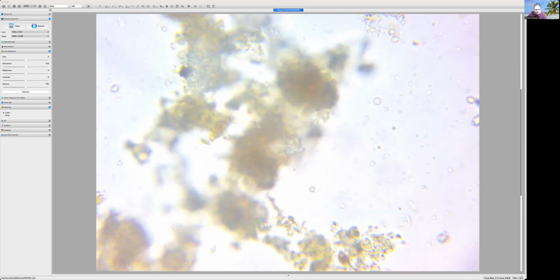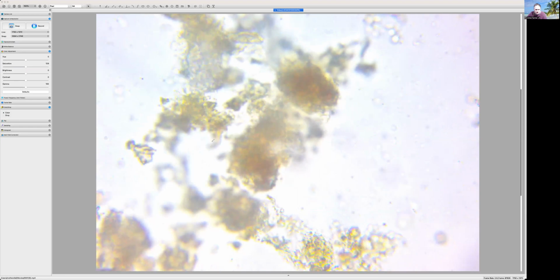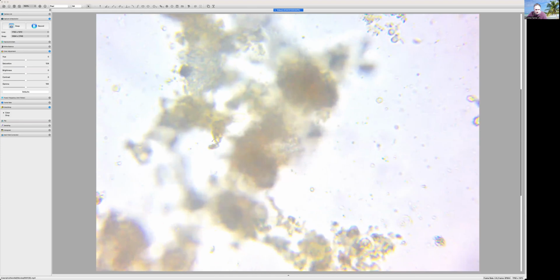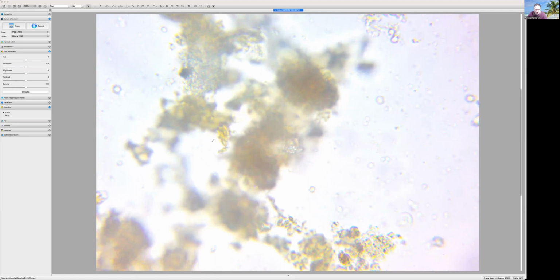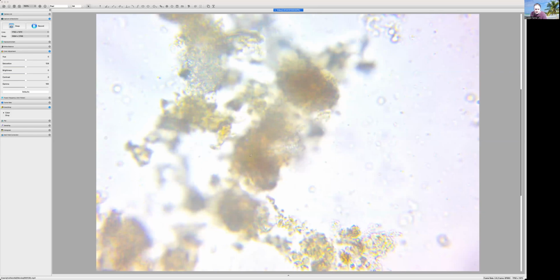Oh my, good question. It's not really coming into view very well either. She's kind of hidden there. It may be an amoeba. I don't know. I'll see if she frees herself up. She's moving slowly, so I can't hardly think that it's a cilia.